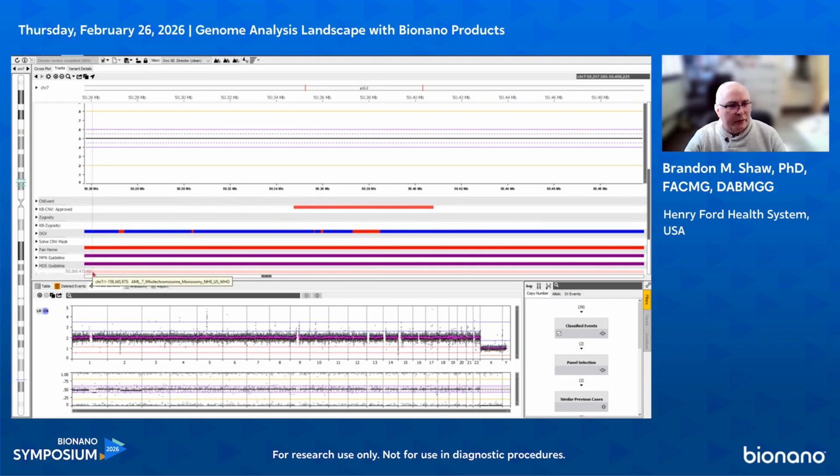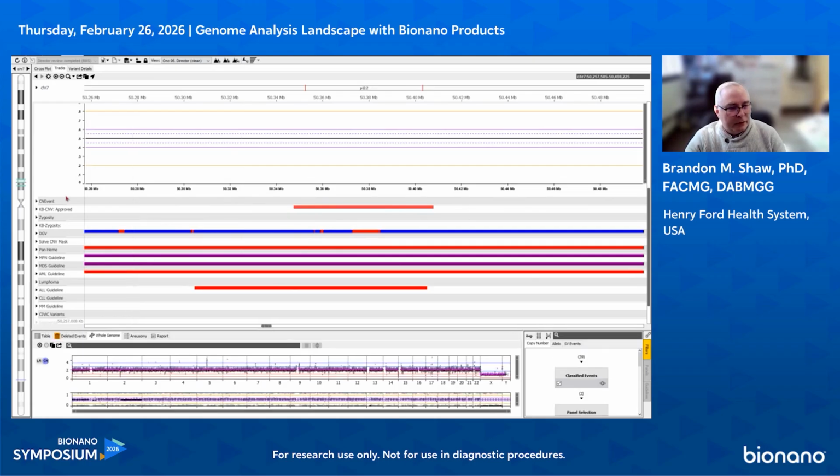You can also add COSMIC genes if you wanted to from a bed file, though we have a bed file that's not included in this version of VIA yet because we haven't quite finished validating it. Or a DGV Gold bed file if you wanted to incorporate that. So everything's really easy to do from that perspective. So that's really all I wanted to talk about with this sample.